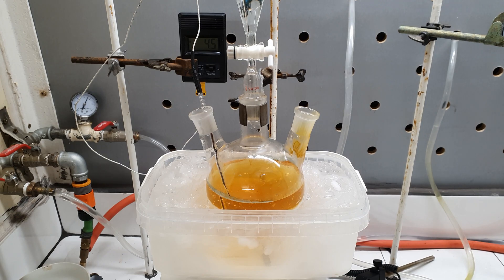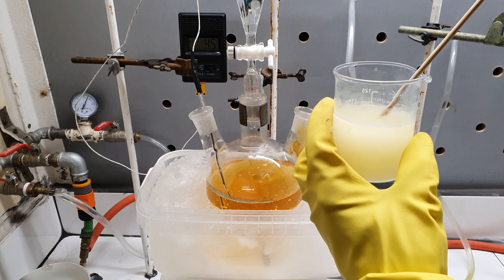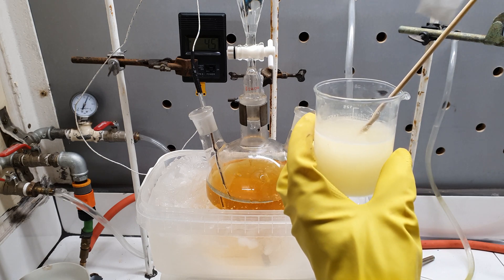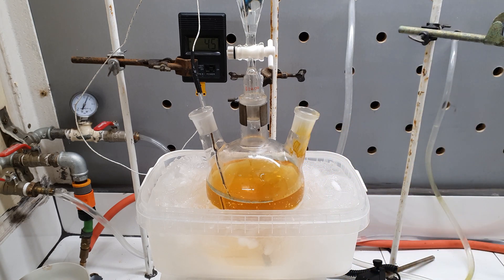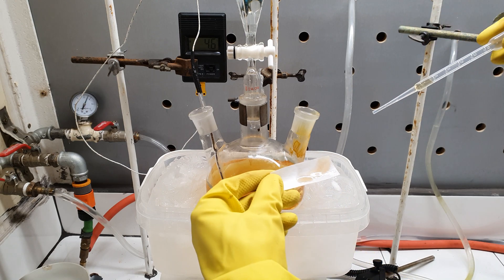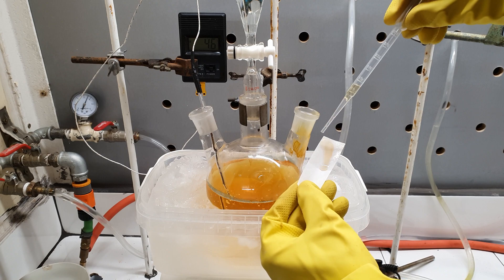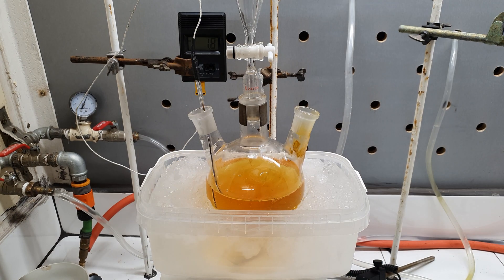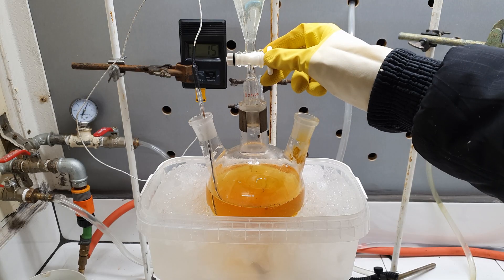A key point when doing a diazotization reaction is to know when you've added enough nitrite. One way to test this is to use a paper soaked in potassium iodide and starch solution — if there is any excess nitrite in the solution, the paper should turn blue. I had never done this test before and I somehow managed to screw it up. I forgot to add the iodide, so I tested it, it wasn't blue, so I added more nitrite. Then I tested it again — still not blue — so I added even more nitrite, and for a moment I even thought my stoichiometry was wrong and made even more sodium nitrite solution and started adding it.